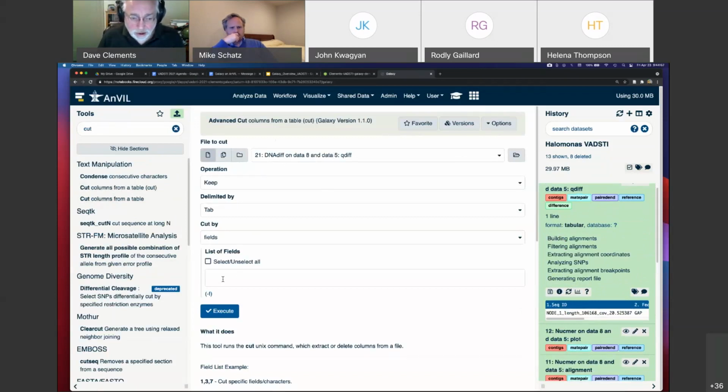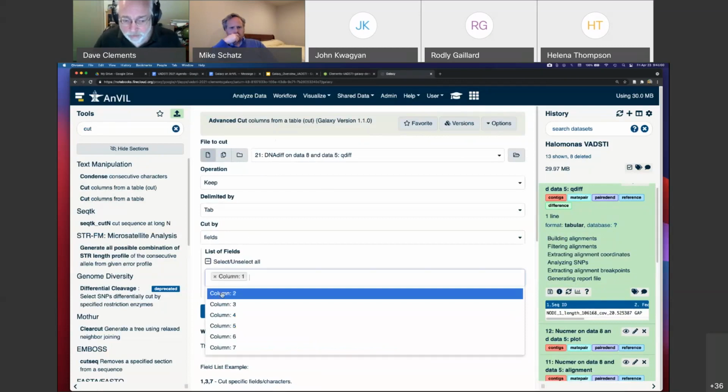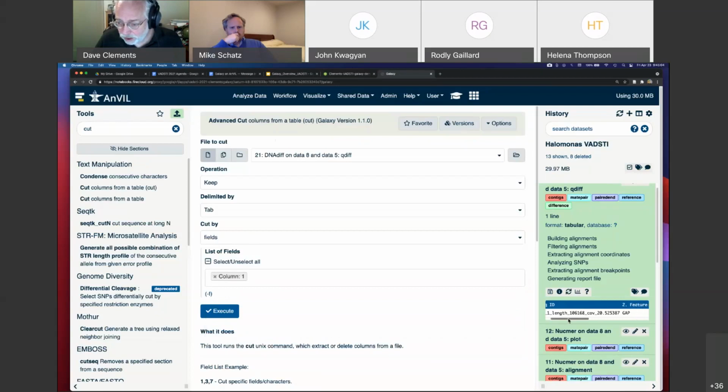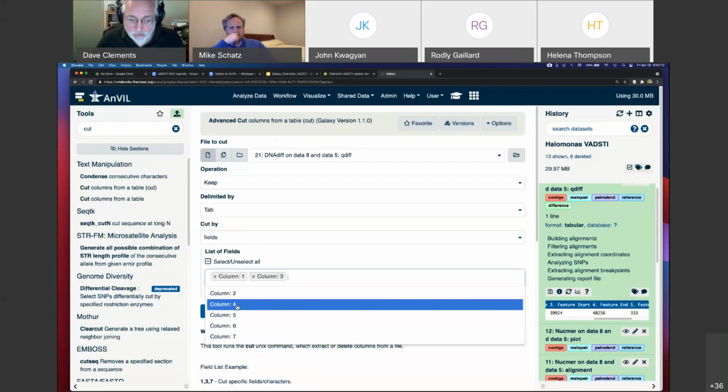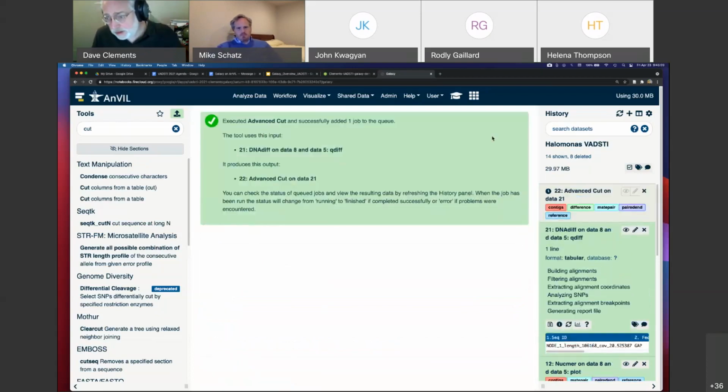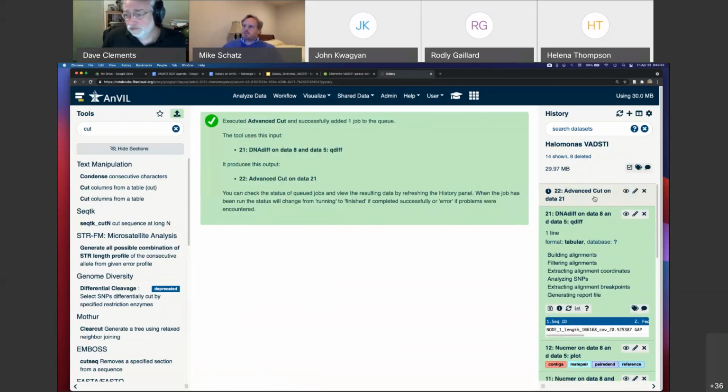And I click down here and I want column 1, that's the name. And I want column, let's come over here, I want column 3, which is the start, and column 4, which is the end. Okay, so I click here and I want column 3 and column 4. And what this is going to give me is just those 3 columns. I click on execute. It's queued. It's going to run, and then I will get back a 3-column data set. Okay.